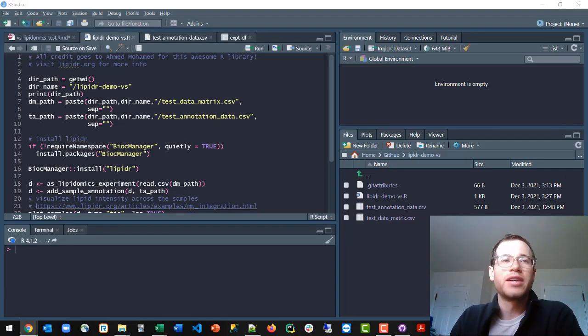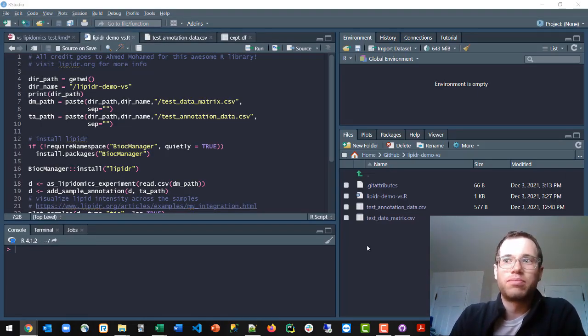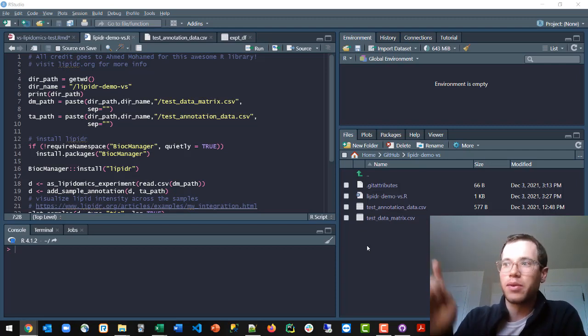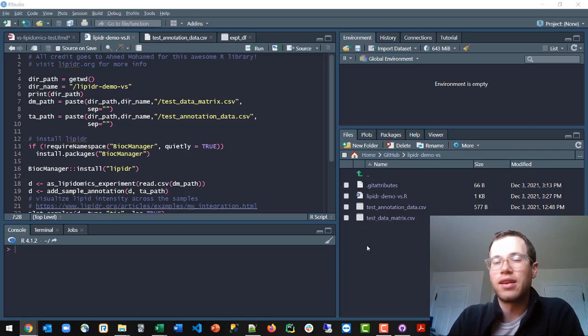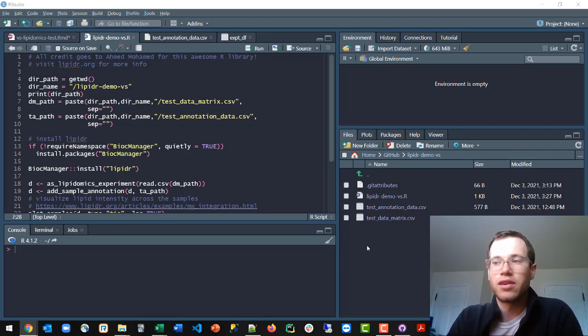Basically, the way in which you do this is as follows. I'll provide a GitHub repo where I've uploaded the sample data that is on the Lipidr website in a CSV format. So basically, you just start out with two CSVs.